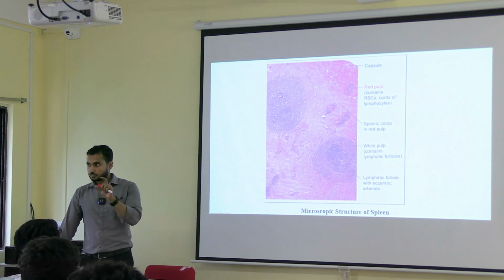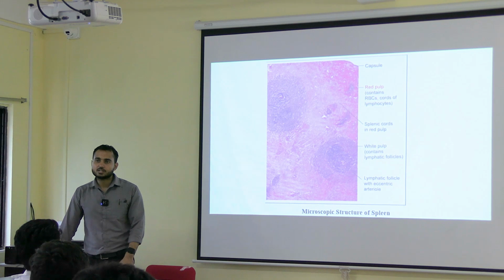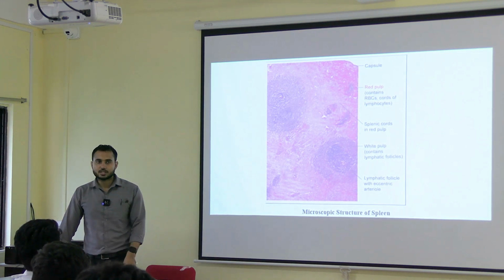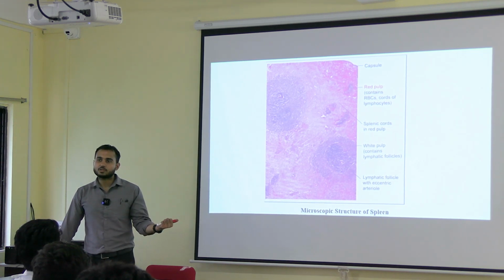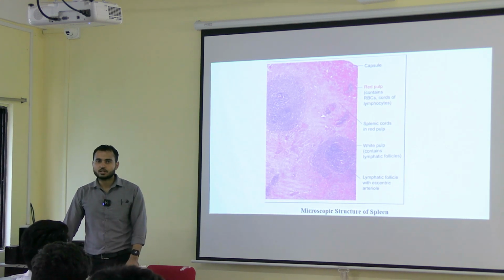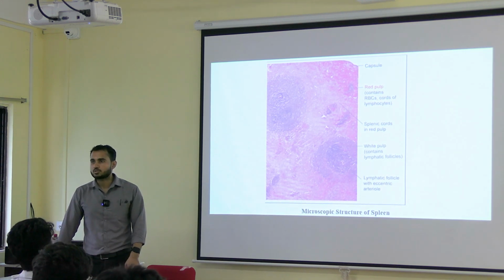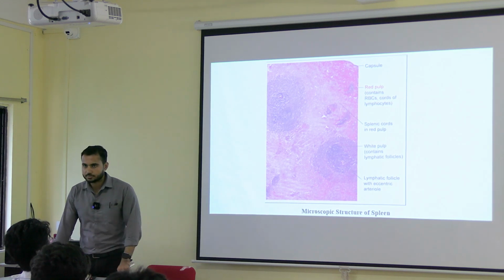But what happens is, if you see the slide of the spleen and if you see the slide of lymph node, okay, some confusions are there, I have seen. Okay, next when we'll discuss about the lymph node, at that time we'll notice that appearances are almost similar under microscope. Students used to get confused. Okay, so how to deal with that we'll discuss in lymph node part.